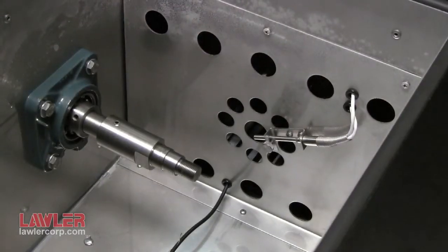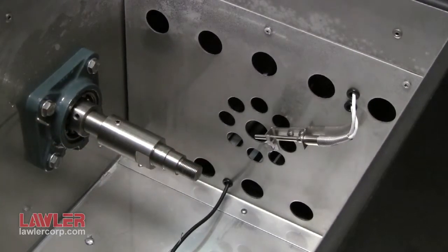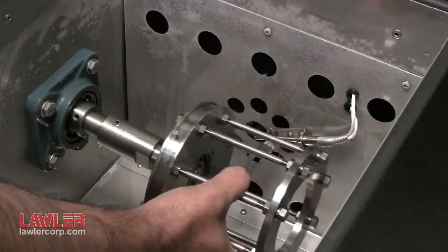We have the shaft itself for the motor, and it's going to be set up for D1478 shortly. Next, let's assemble the cage with bearing onto the shaft.